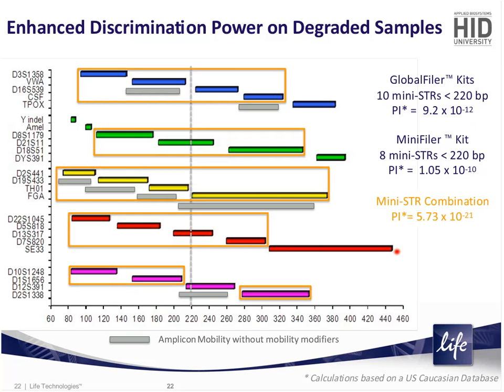This is a massive amount of information that you'll be able to recover from those degraded samples. It will minimize the number of partial profiles that you have to deal with. It will minimize the number of partial profiles on international databases, and thereby criminal intelligence searches to single source reference samples will come back with far fewer adventitious hits than was previously the case, and that should significantly improve the utility of international databases for criminal intelligence purposes.